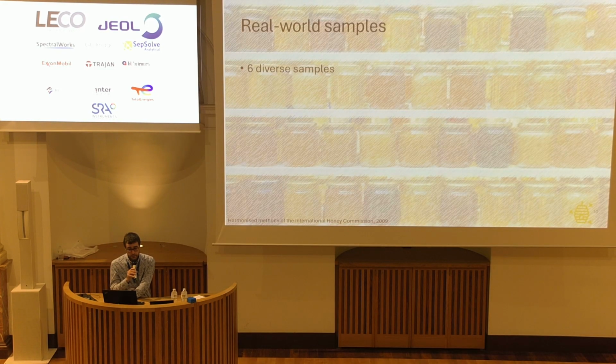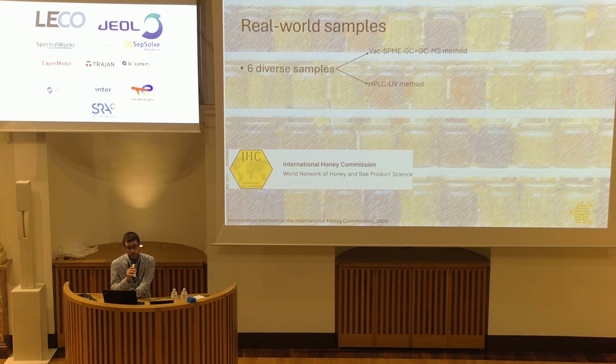We trialed the method with 6 diverse real-world samples. We analyzed them with our method, and also with the official HPLC-UV method. That is the direct injection after dilution of honey into the HPLC.